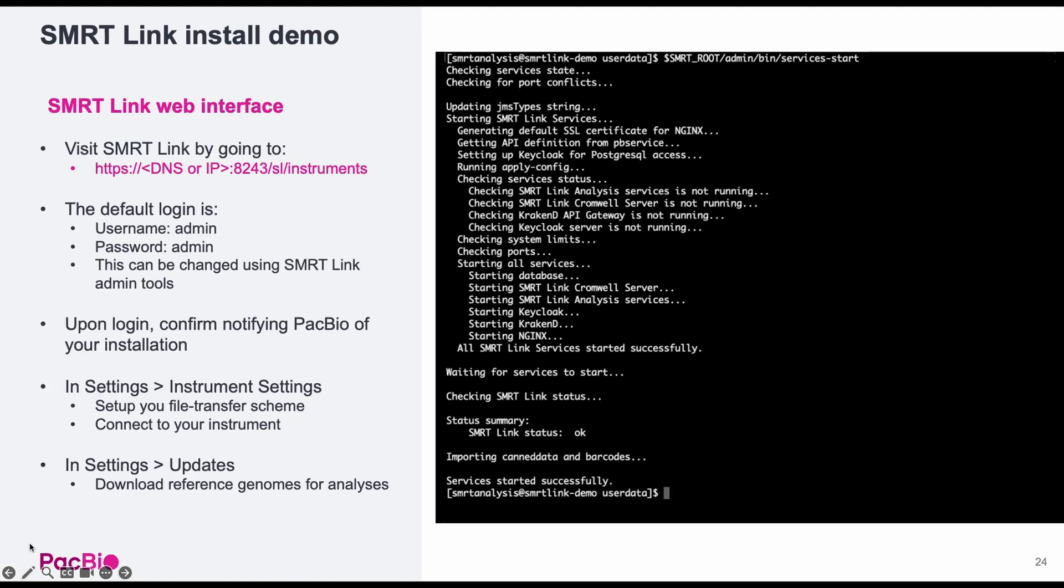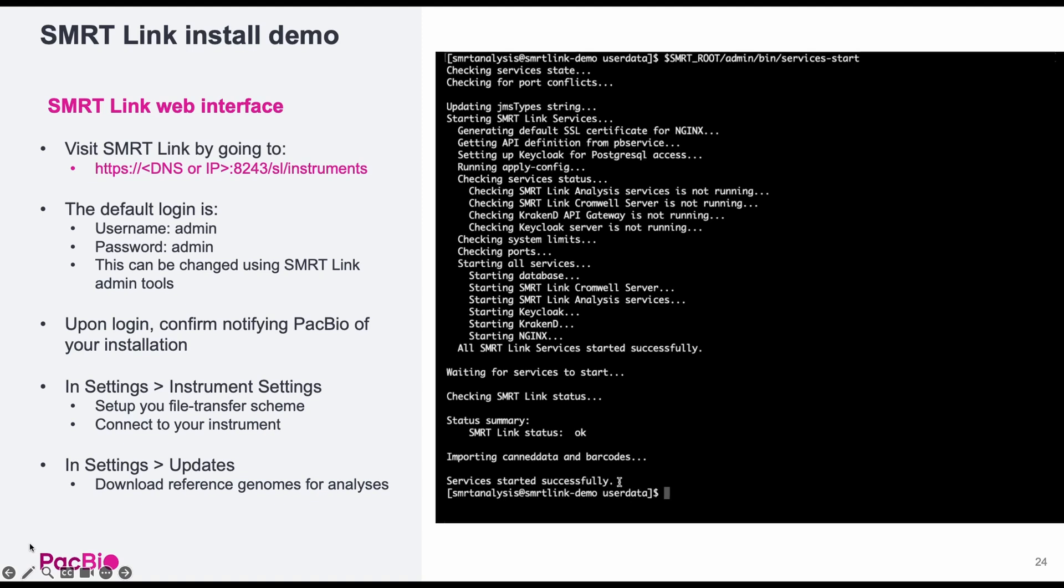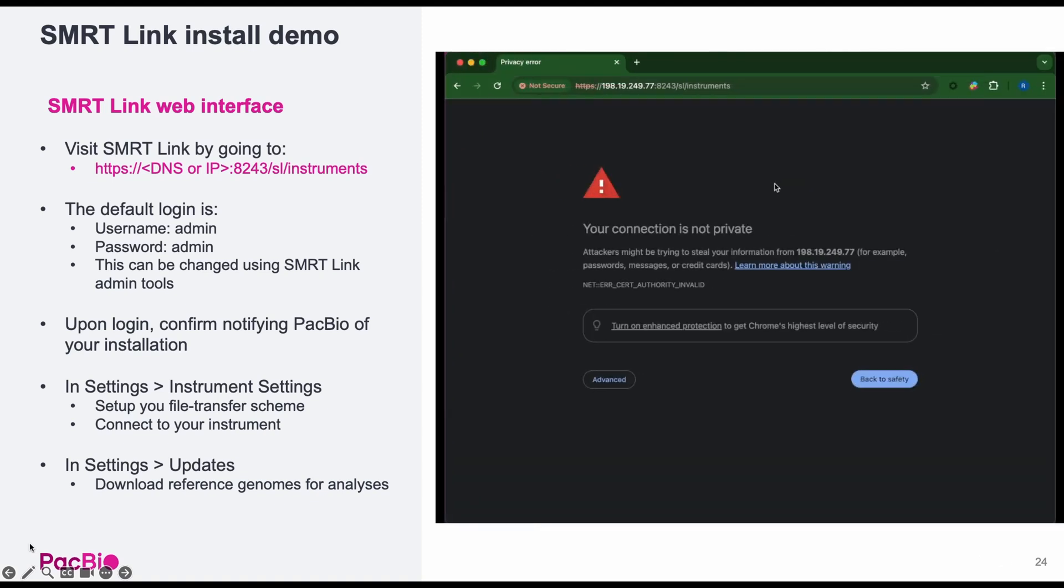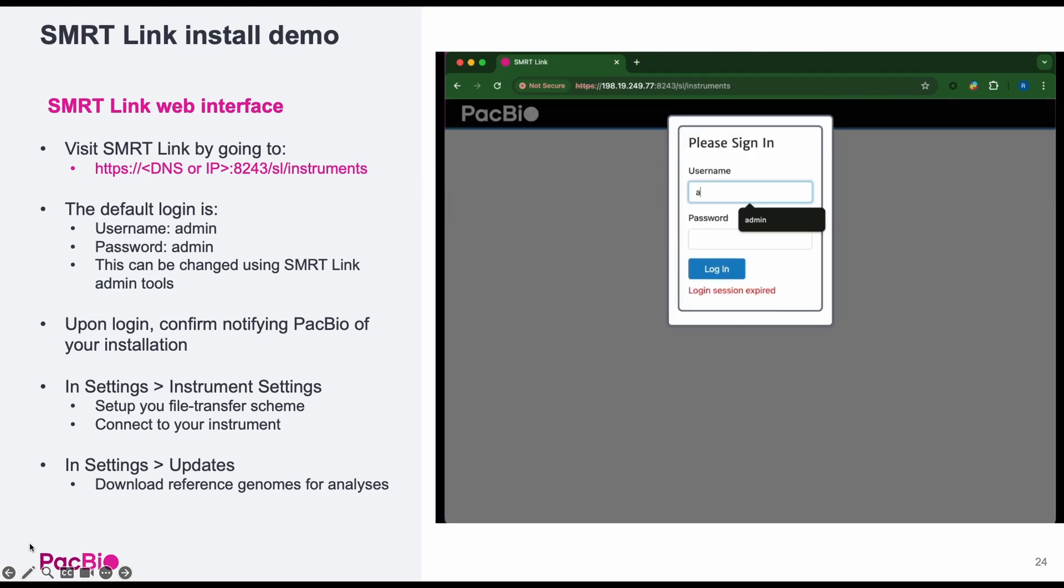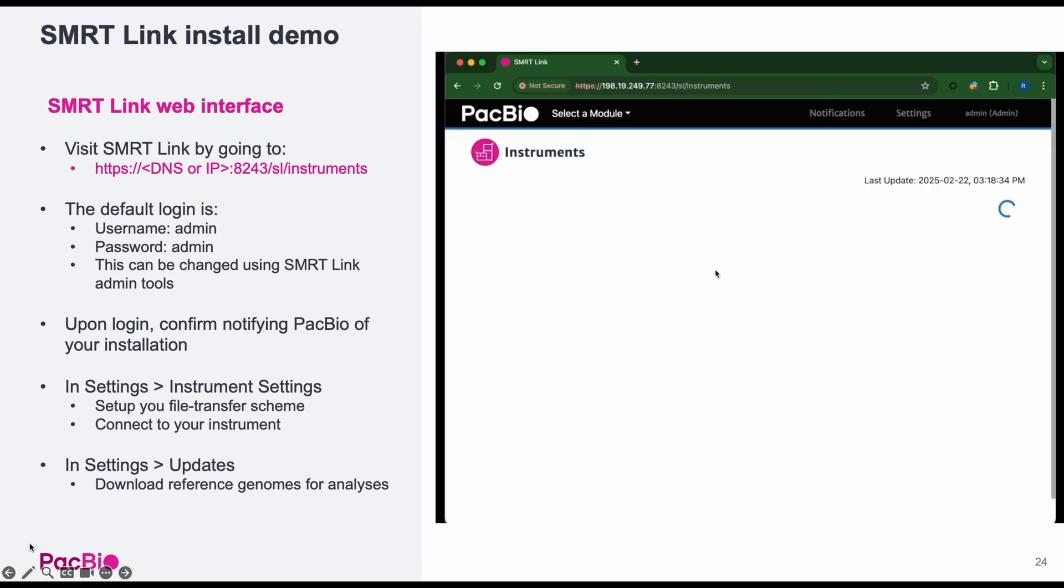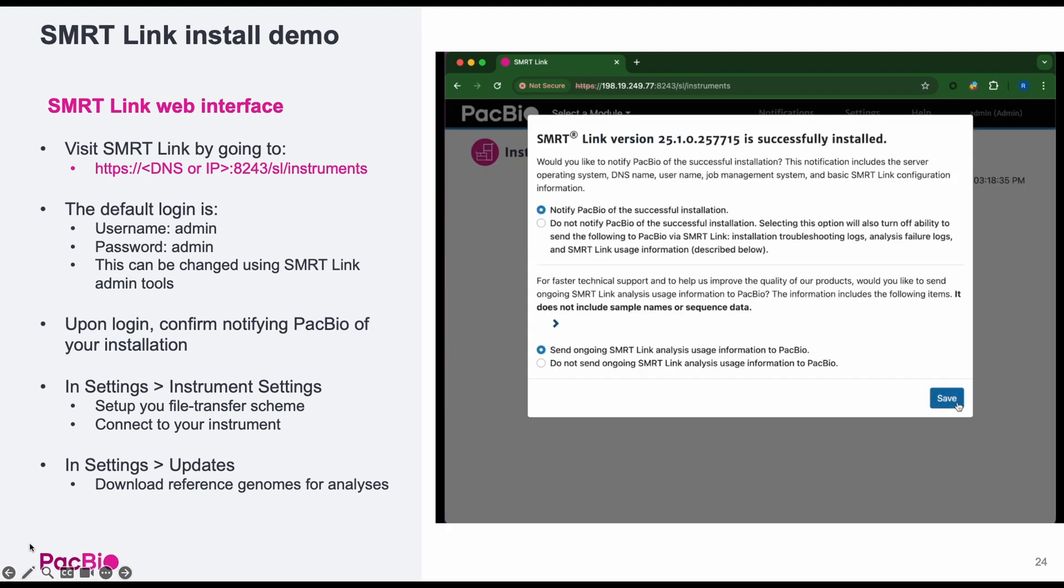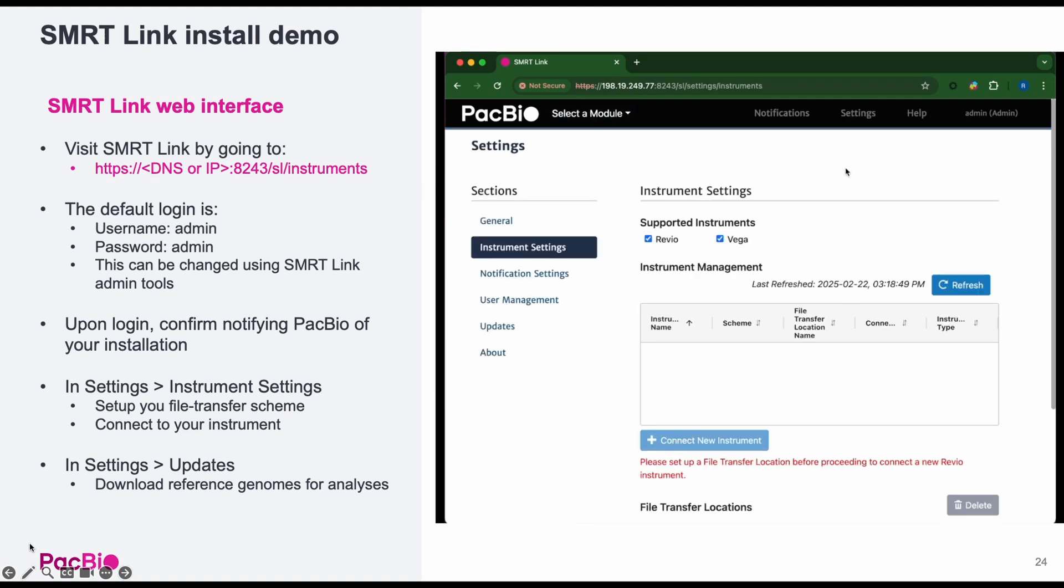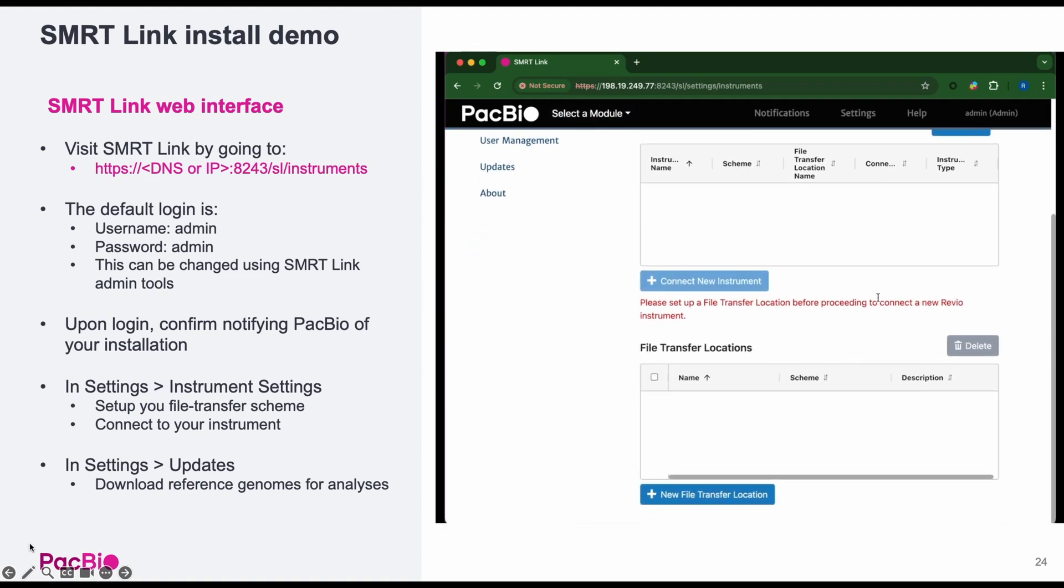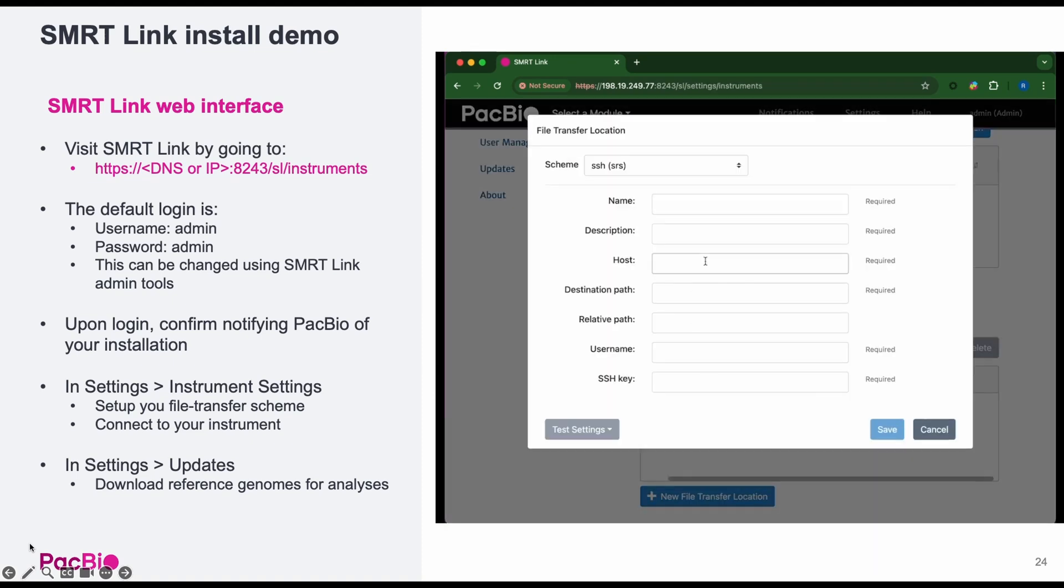Once started, you can navigate to the SmartLink UI by opening a web browser and navigating to the SmartLink server's DNS name or IP address with port number 8243/SL. The default username is admin and the password is also admin. But these can be easily changed using the SmartLink admin tools. See the SmartLink install guide for more details. Upon login, you'll be prompted to notify PacBio of your SmartLink installation.